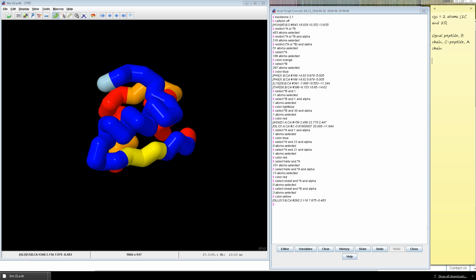But there are two interacting chains here for its quaternary structure. So on the B chain, there are 2 amino acids that you need to show. Cysteine number 7 and cysteine number 19. As well as on the A chain, you need cysteine 6, cysteine 7, cysteine 11, and cysteine 20. And that should sound very familiar to you from when you were doing the folding. These were the amino acids that you were showing that interacted, and these are the ones you were supposed to connect on that map, on the gene map.